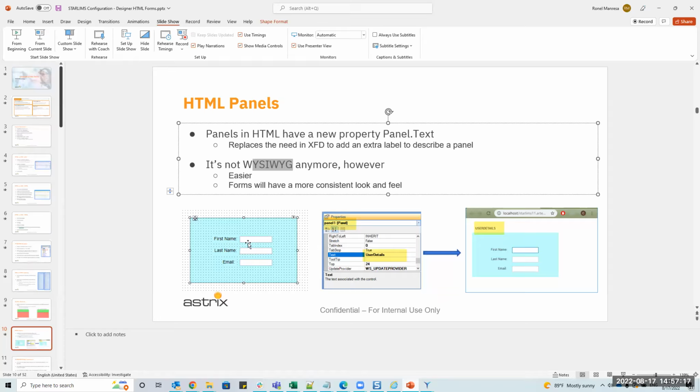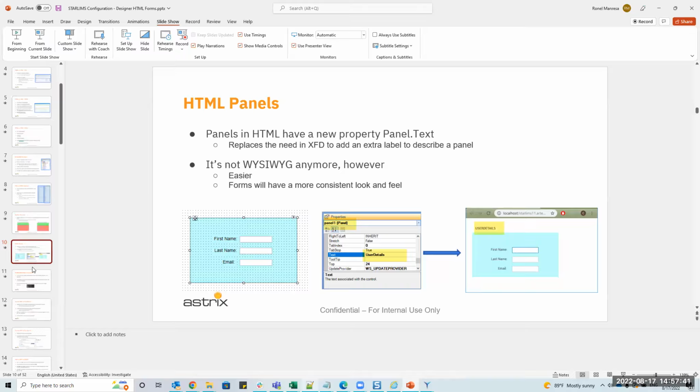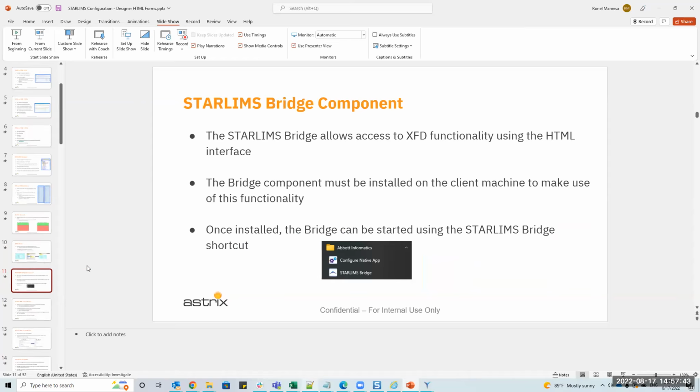Here in HTML, if you don't have the right properties, the right layouts, the first name could end up at the bottom, and you're just like, why? It doesn't make sense. When I look at it in the designer, first name is all the way up here. Why does it move to the bottom? Well, because you messed up the relative layouts. And things like these properties, you don't even see them until you hit play. Okay, so we'll see some of that when we get into the exercises. I'm just going to keep moving.